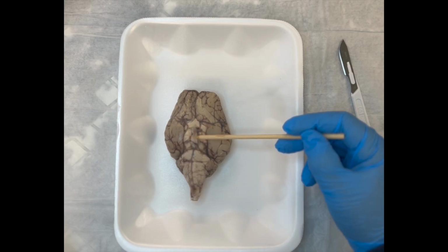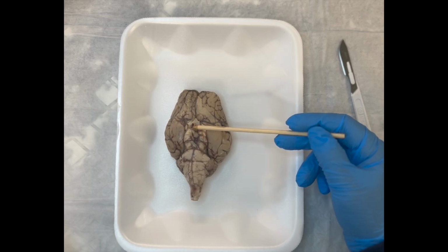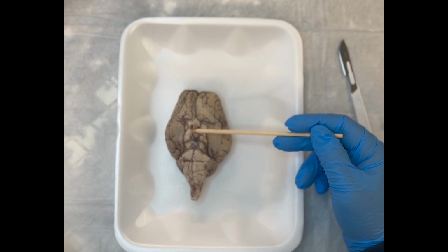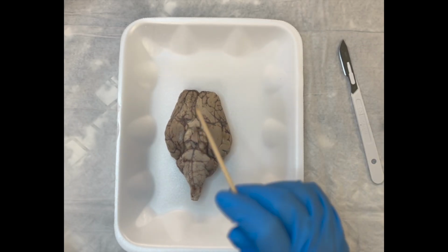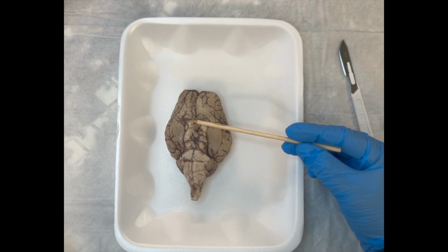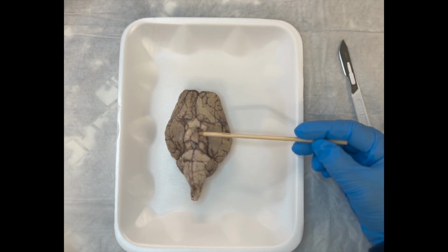Then next to that, we have the pituitary gland. So fortunate for us, this was left intact. So here's that gland right there. It actually has an anterior and posterior component to it, so it is bilobed. This is the infundibulum, the stalk from which the pituitary gland hangs. And if we were to poke a hole into that infundibulum, it would travel into the hypothalamus. Collectively, the hypothalamus and pituitary gland have all to do with making hormones for the body and regulating our endocrine system, our hormone system. So very, very important brain structure there.